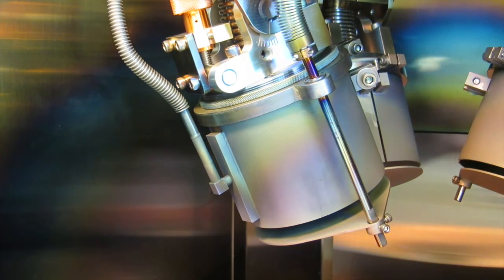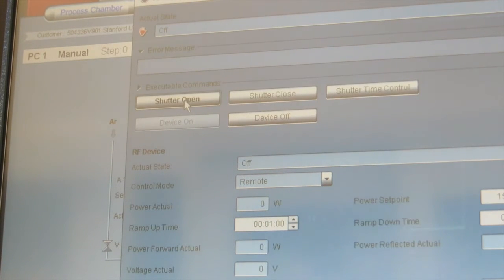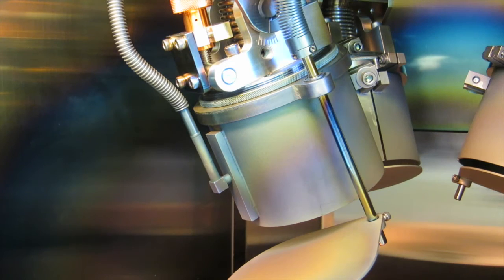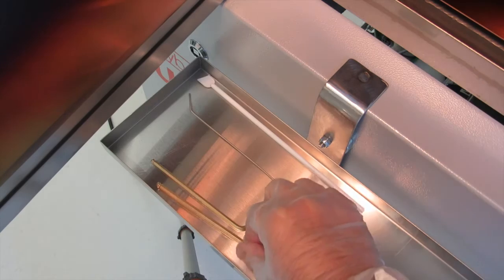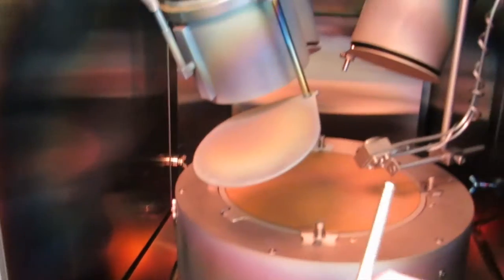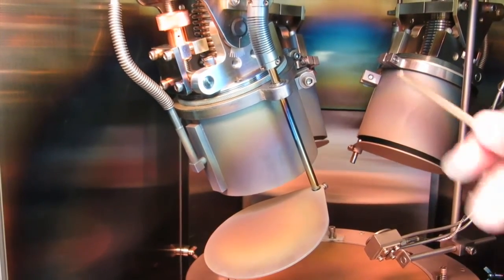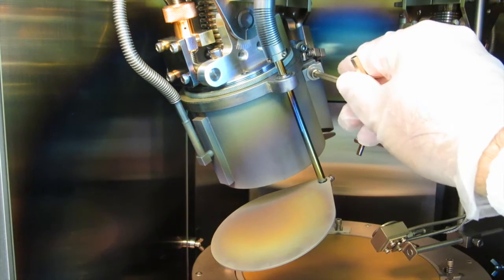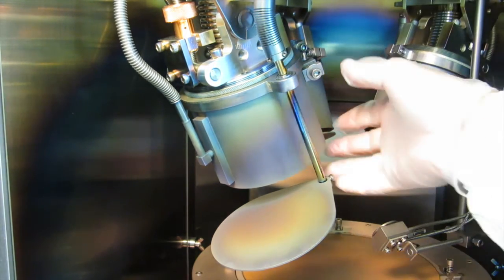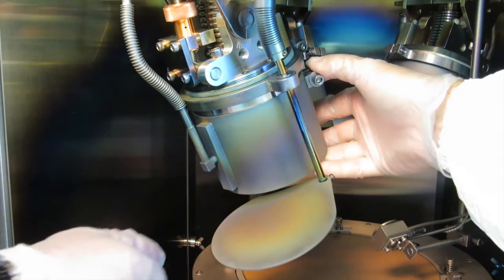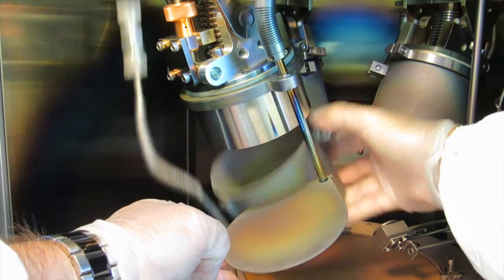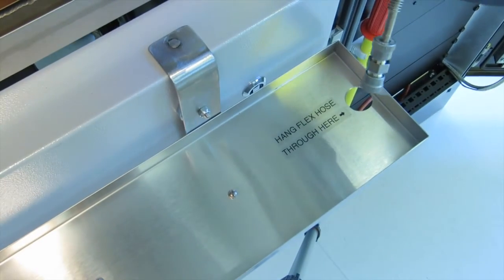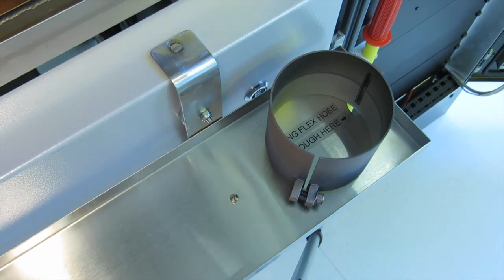The next step is to remove the chimney but as you can see the shutter is in the way. So you go onto the control panel and open the shutter. Then you take your 3/16ths Allen hex key and you loosen this bolt right here. You only need to back this up one or two turns so that it's not squeezed onto there. Then it's loose. The shutter is still slightly in the way but there's enough play in it that you can jiggle it out of the way. Just be gentle right here. There's a hole in the tray here so you can feed this fitting and the hose down into there. Set it right there on the tray.